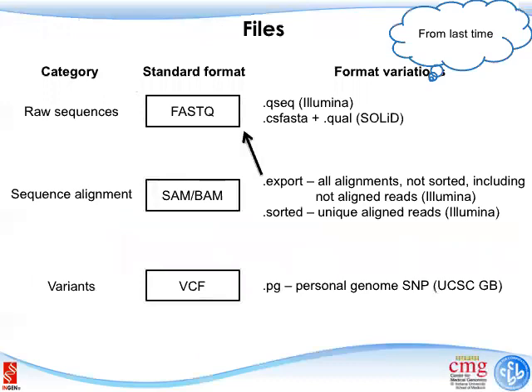And the last point that I talked about in the last lecture was the standard data formats. For next generation sequencing, you can make your own file formats, whatever you do, it doesn't really matter. But the standard formats are FASTQ files, the BAM or SAM files, and the VCF files. This really corresponds to the 3 levels of quality we talked about. The FASTQ files are just the ACGTs and the base quality for every single one. The SAM and BAM files tell you for each individual read how the alignment goes and what the alignment quality is, most of the information related to how well this particular sequencing read aligned to the reference genome. And the VCF file is about individual locations where genetic variants are identified.